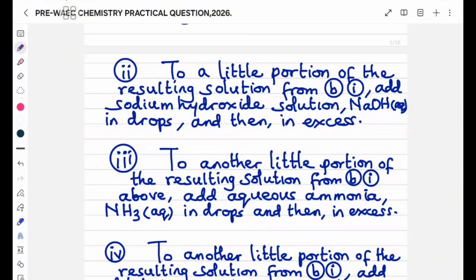But the mixture will look cloudy. And what is the reason for that? It's because of the presence of most of the starch. The starch is still in that residue. It is not only the inorganic salt. There is still presence of most of the starch in the residue. Only a few amount of the starch will dissolve in the filtrate.